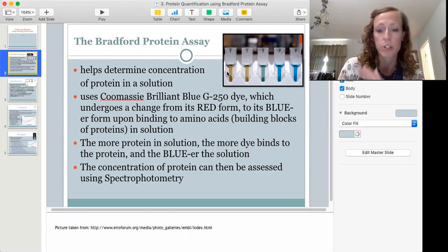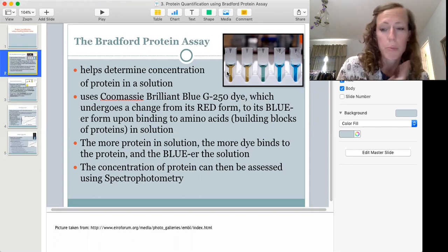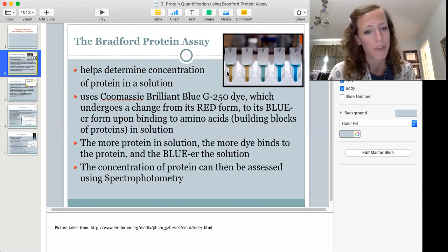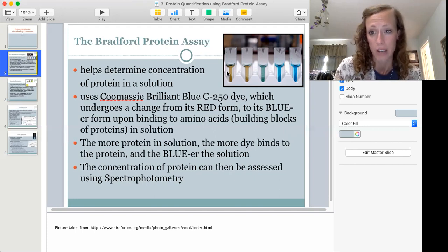That indicates that whatever that dye is mixed with in that cuvette, it has a lot more protein than the cuvettes that are less blue or more red brown. So the way that this works is that when the dye binds amino acids, which are the building blocks of proteins, it undergoes a change. And that change is observable by the fact that it changes color. The more protein in solution, the more dye will bind that protein and the bluer the solution will be. So we can readily observe this, but we're not going to make it that simple. What we want to do is put a number to it, assign the absorbance value to this particular concentration of protein. And we do that using spectrophotometry.